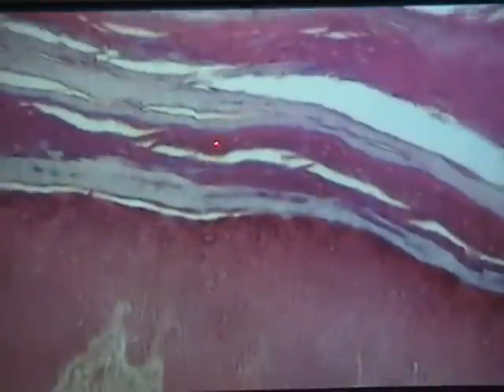But even at this low magnification, you can kind of get a sense that these cells are more cube-shaped. And as we go up, the cells are becoming flatter. And you get up here and it just looks like something dry, more like fish scales. Let's increase the magnification.